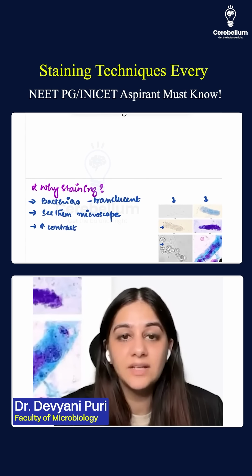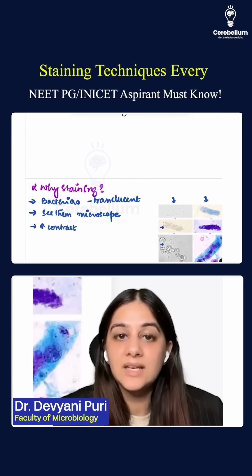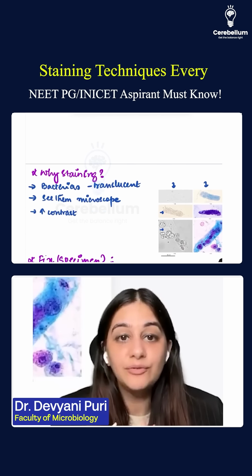So there are two types of smears that we can make: either directly from the specimen, the clinical sample, or, if we have isolated a colony on an artificial media, we can make the smear from that. On a glass slide, we make that smear, and then what do we do? We have to fix the specimen.